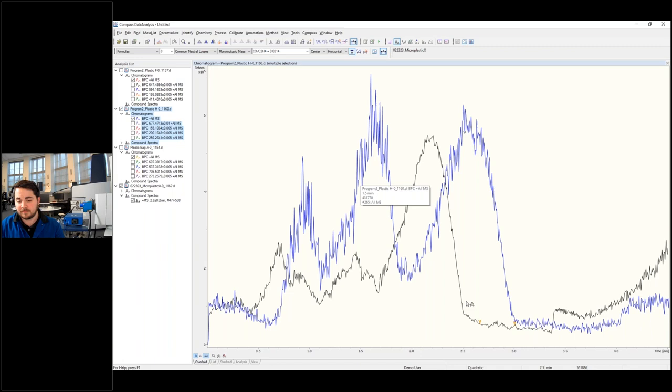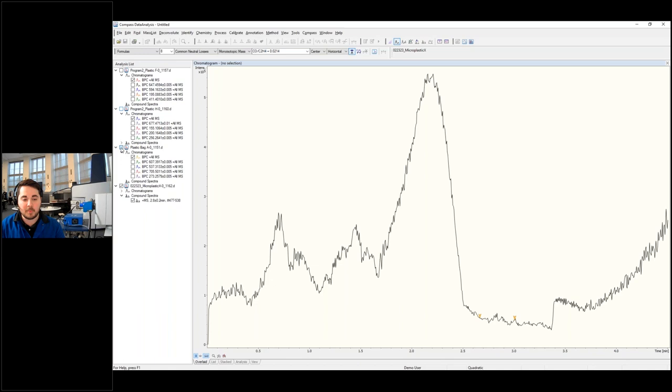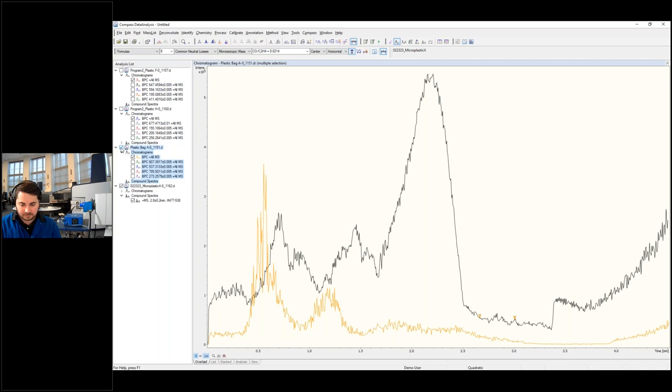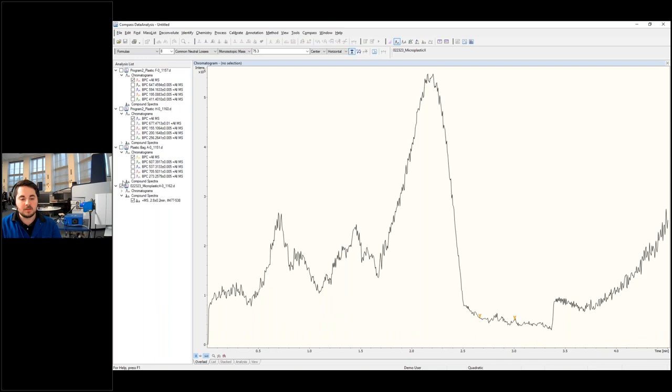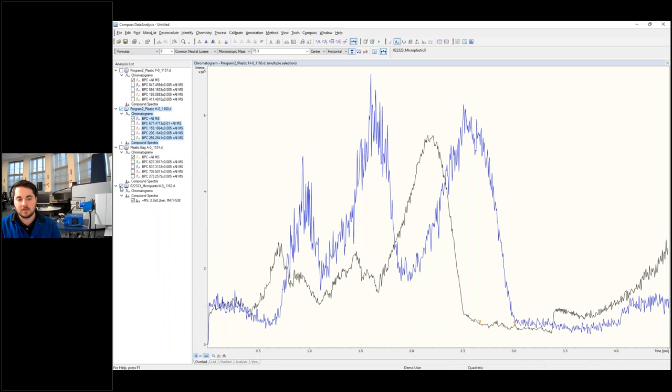So let's take a look at Plastic H, which was a trash bag. So that's going to be in blue. Our unknown is in the black line. We're seeing similar patterns. It's shifted off by about 30 seconds, and that just could be the glitch that we had with the ion rocket software. But we are seeing kind of these three separate peaks followed by this flat line, which is going to be that polyethylene distribution, which is similar to what we saw earlier in our spectra. So that looks like a good candidate. Lastly, Plastic Bag A, which was a piece of plastic bag that came from packaging material. In the beginning, we're seeing these kind of two peaks that are similar. However, the profile towards the latter half of the run looks completely different.